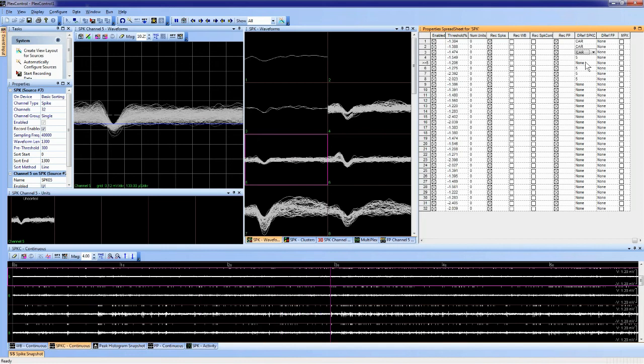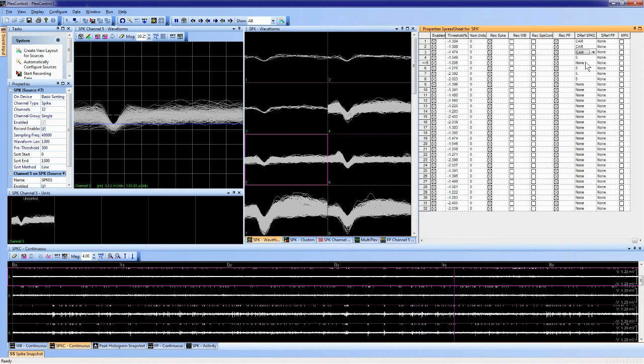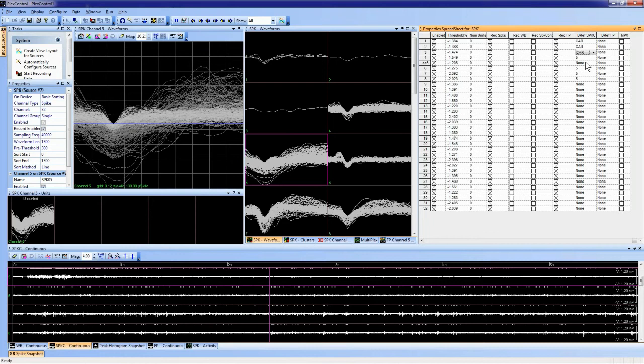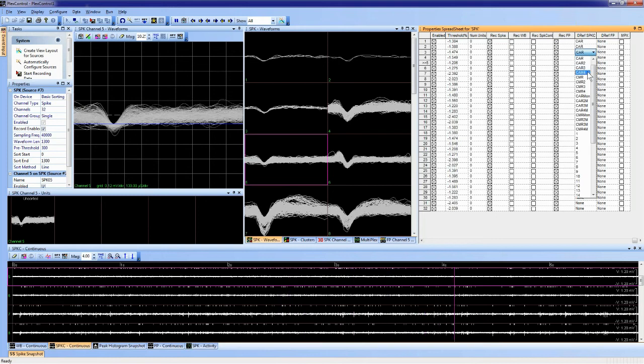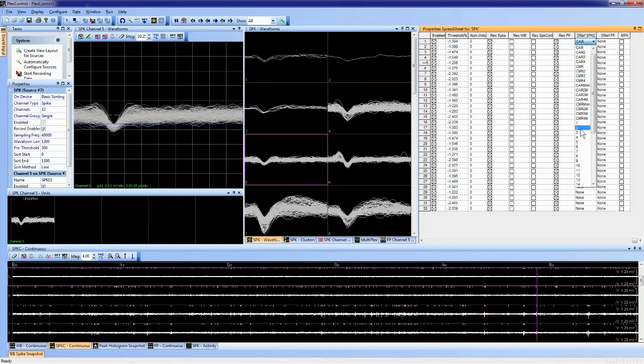It's a useful way for getting rid of signals that might be common amongst a whole bunch of channels, especially if you don't have one channel without a signal of interest. This can also be useful if there's multiple implants or areas being recorded from. Another option could be if you have multiple animals being recorded with the same system. You have multiple CARs, you have multiple CMRs. CAR stands for common average referencing. CMR stands for common median referencing.